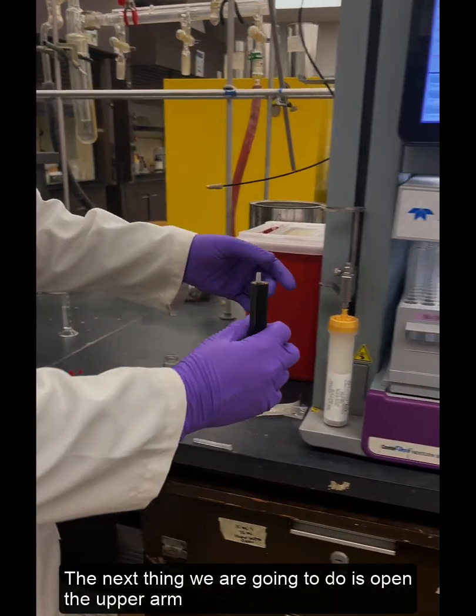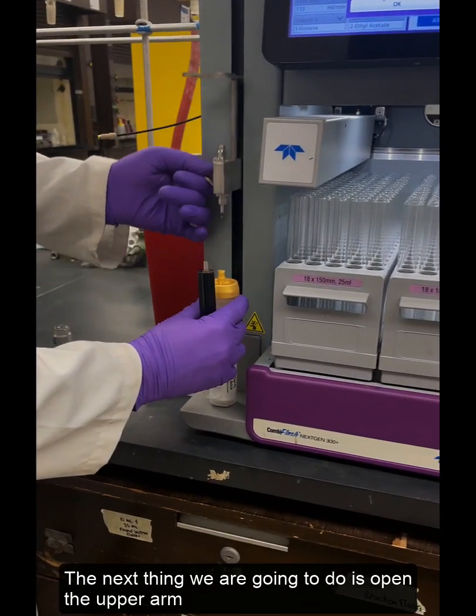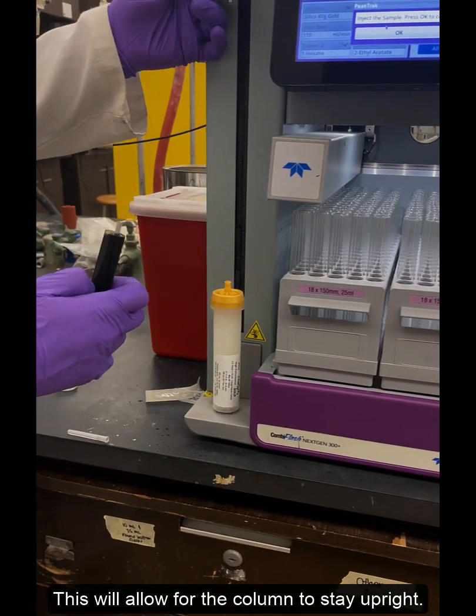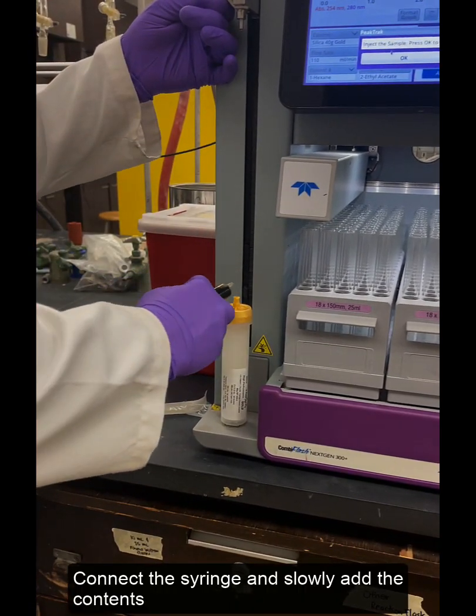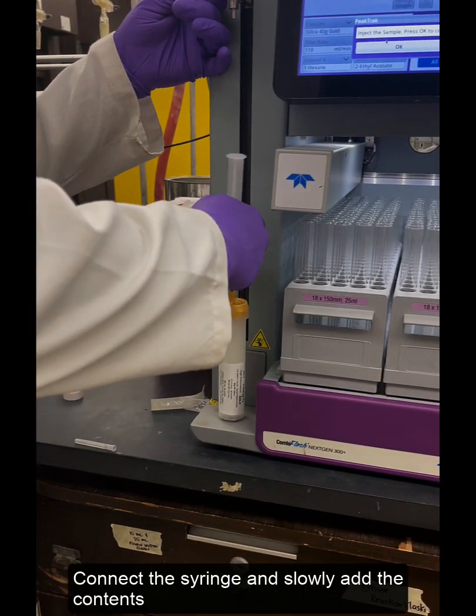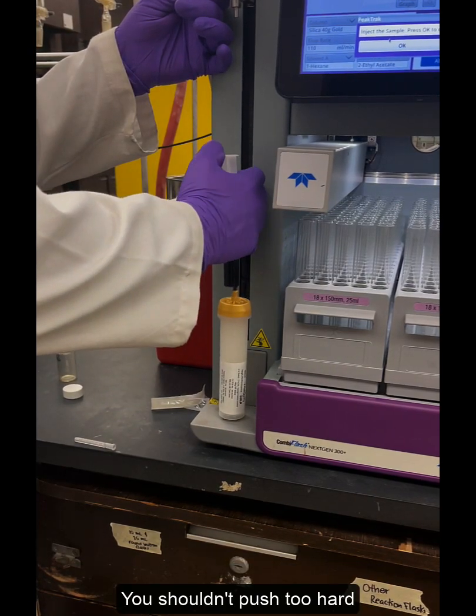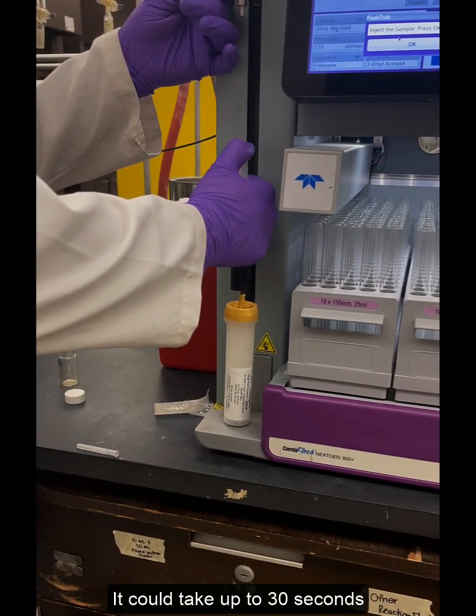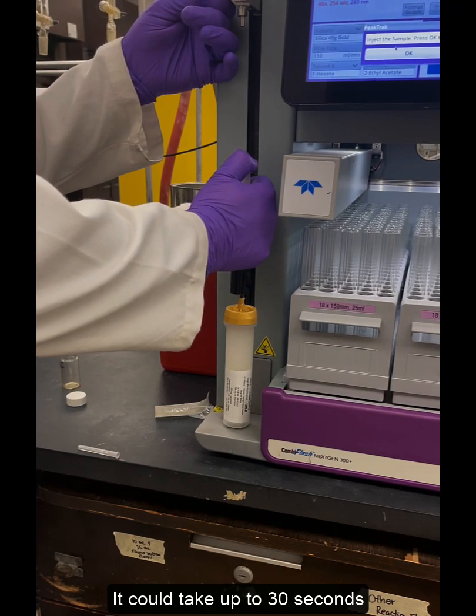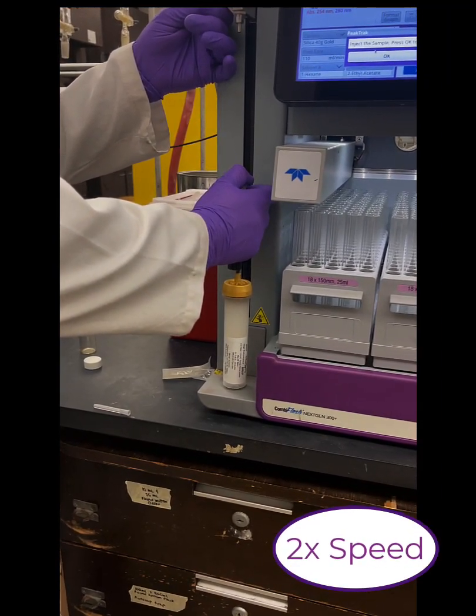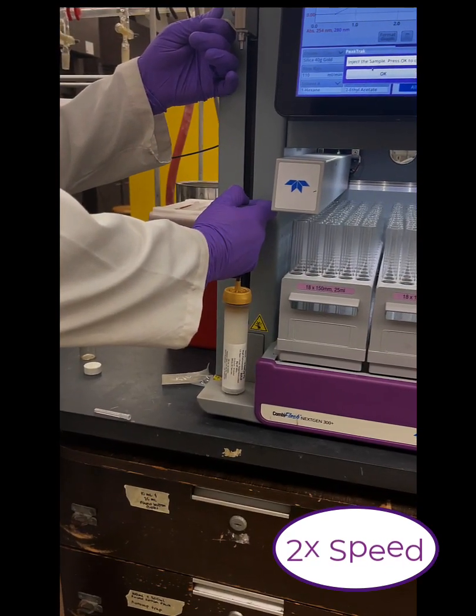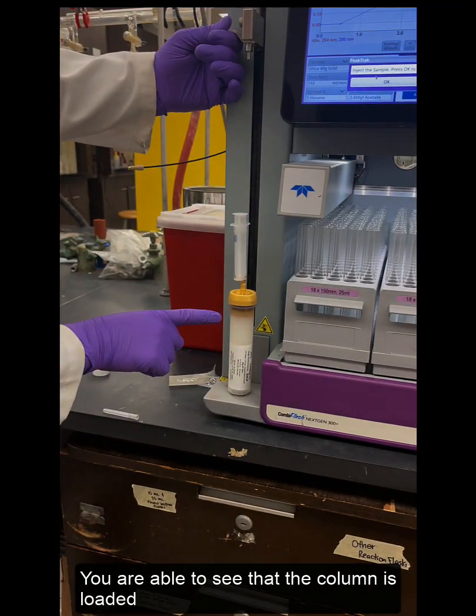Next thing we're going to do is open the upper arm which will allow the column to stay upright. We'll connect the syringe and slowly add the contents. You shouldn't really push too hard and it could take a couple seconds, maybe up to like 30 seconds. Now you'd be able to see that the column is loaded.